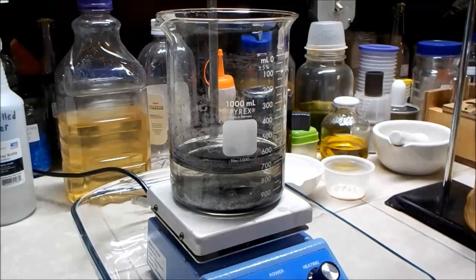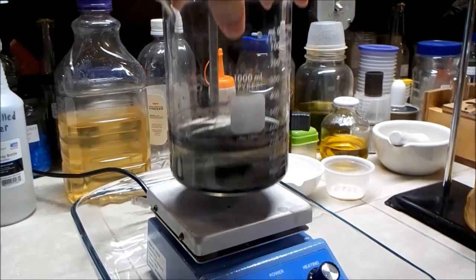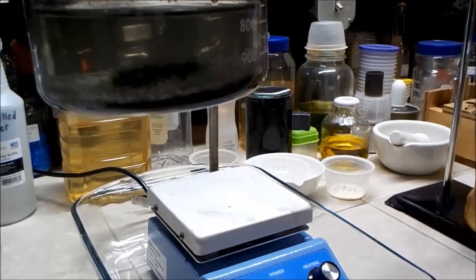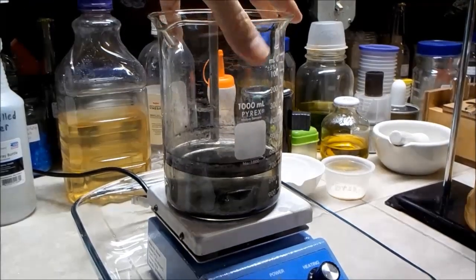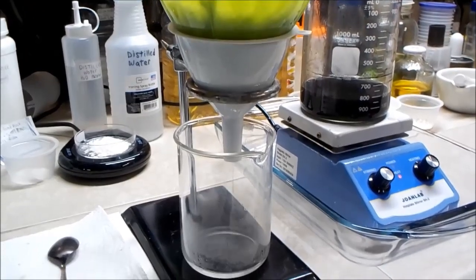After stirring and heating, then letting it cool down and settle out, there's a very clear liquid in there now. I can probably filter that out and then it'll look really good.